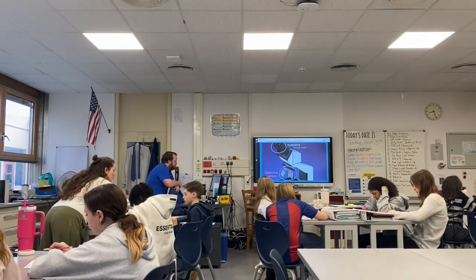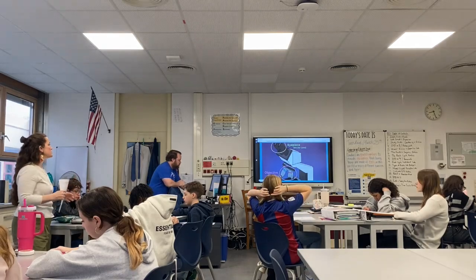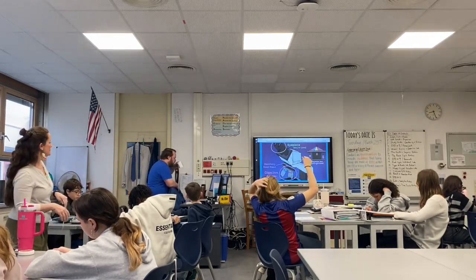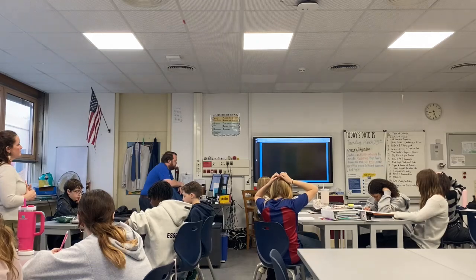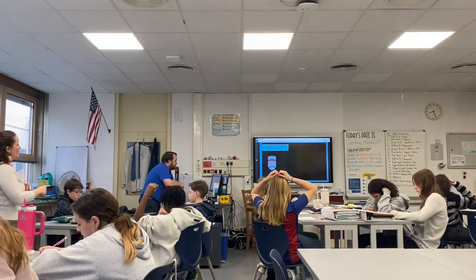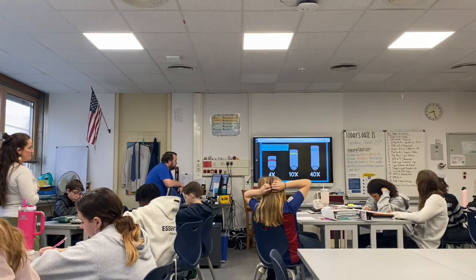In fact, this is often referred to as a compound microscope because it has two sets of lenses. You can see that the objective lenses are attached to this revolving nose piece, which allows them to be rotated, so you can select a certain one that you want to use. With my particular microscope, I have 3 objective lenses: a scanning objective lens that magnifies 4 times, the low power objective lens that magnifies 10 times, and the high power objective lens which magnifies 40 times.